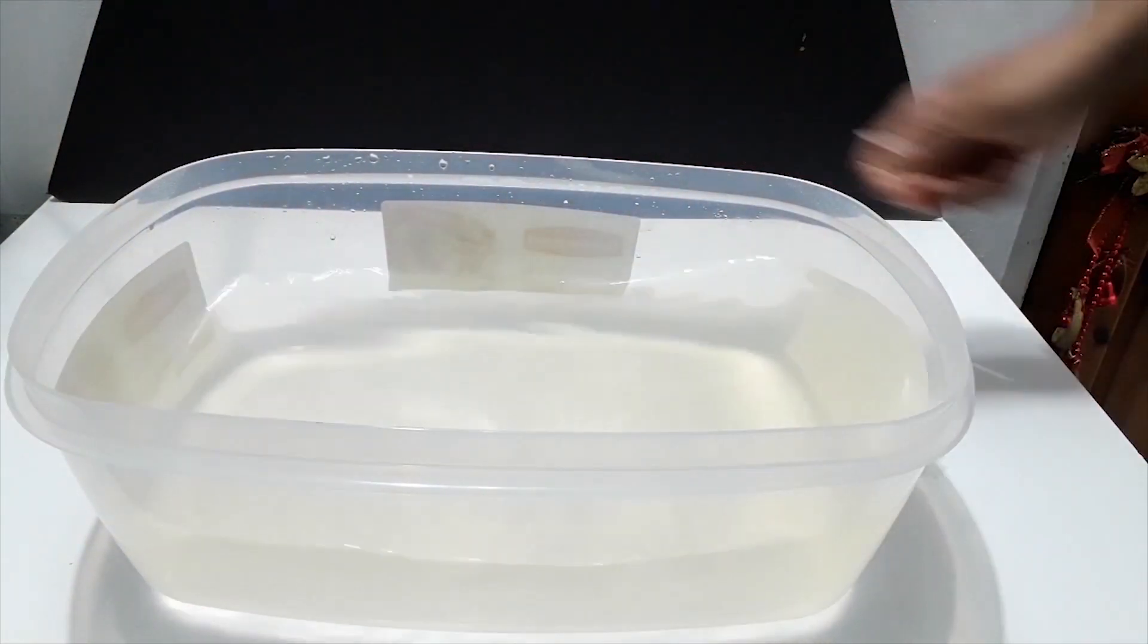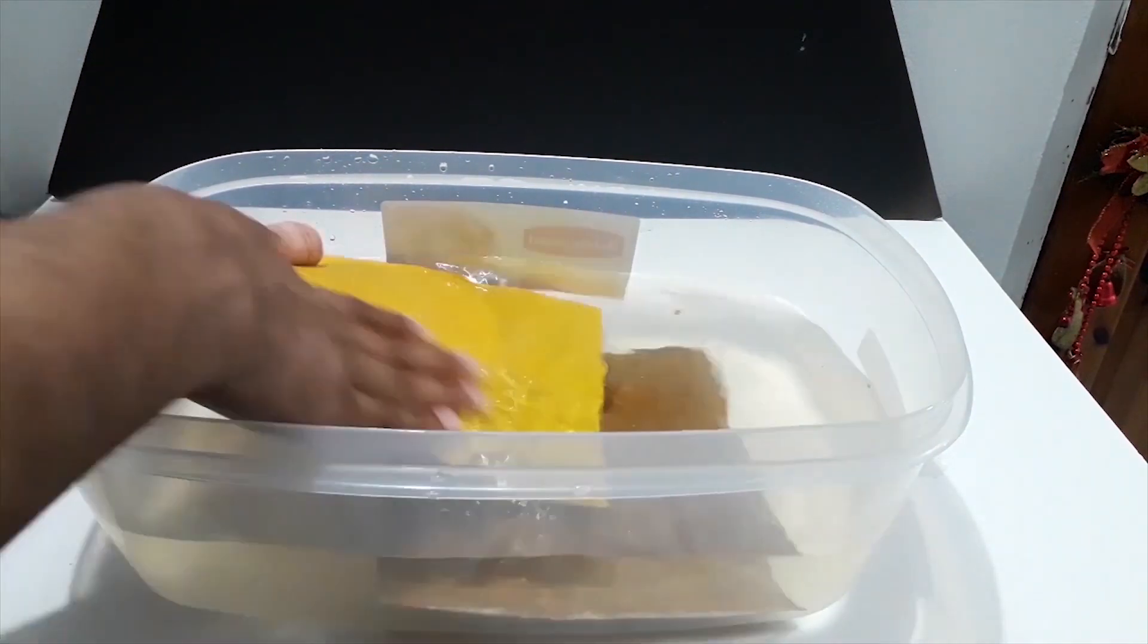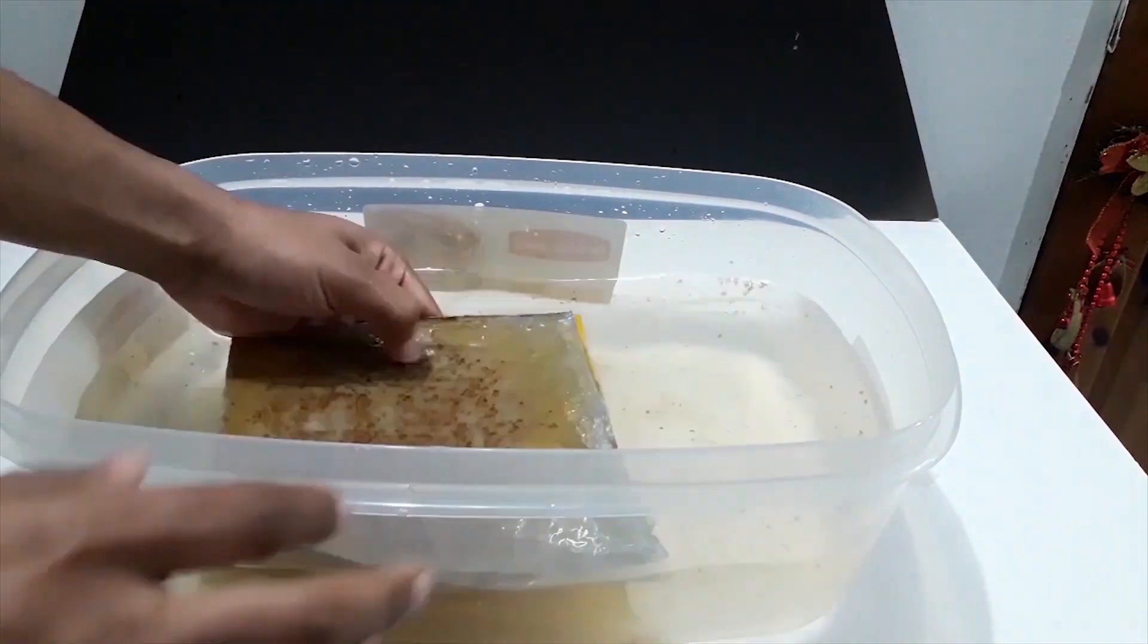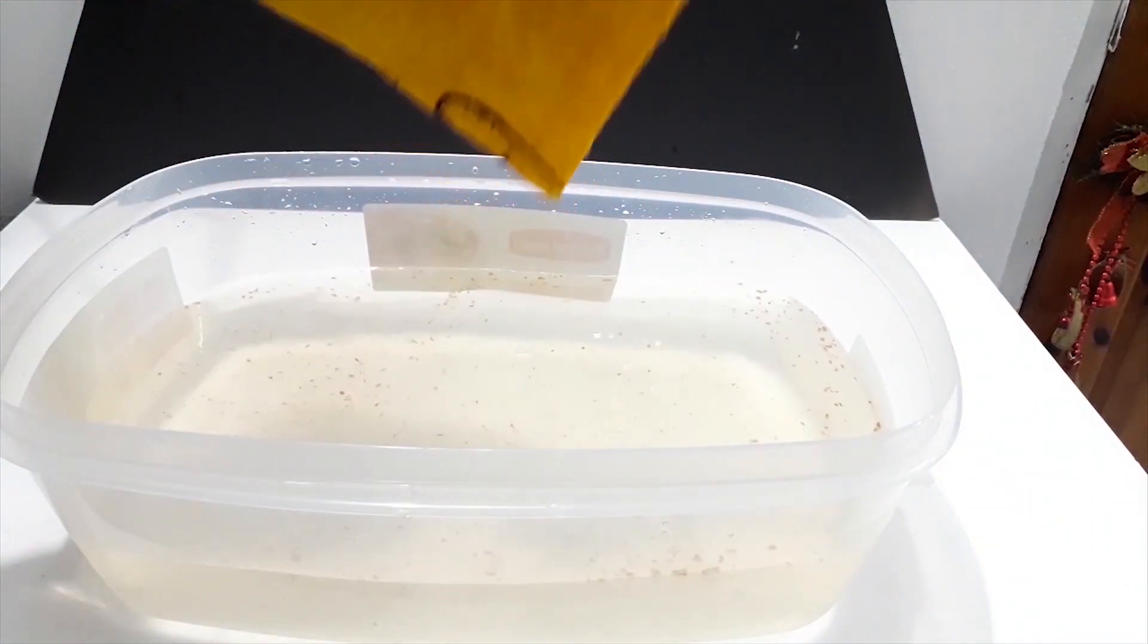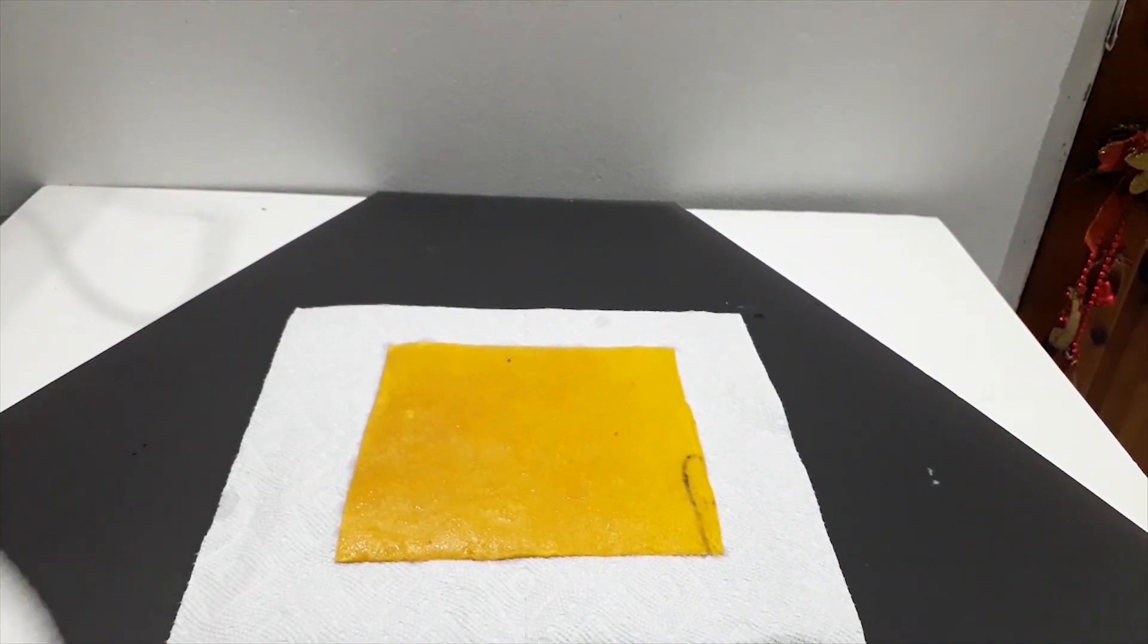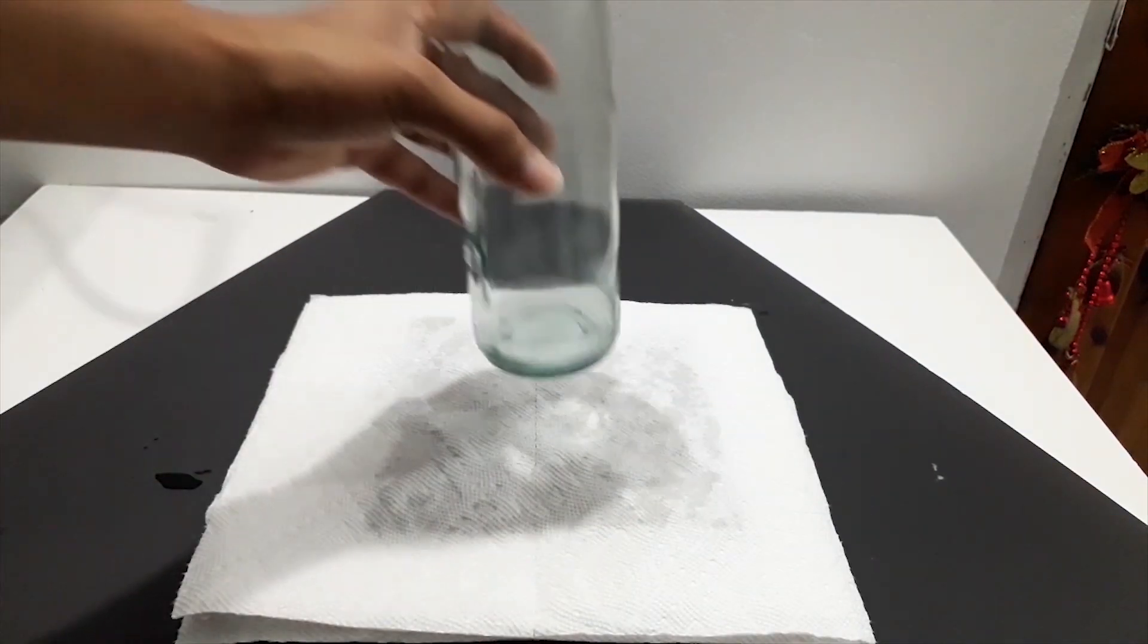The membranes then need to be washed to remove any excess unreacted glue and citric acid present for about 5 minutes. After washing the membranes, to speed up the drying process, the membranes are then placed between two pieces of paper towel and a weight on top of it. Here, I'm using a glass bottle.